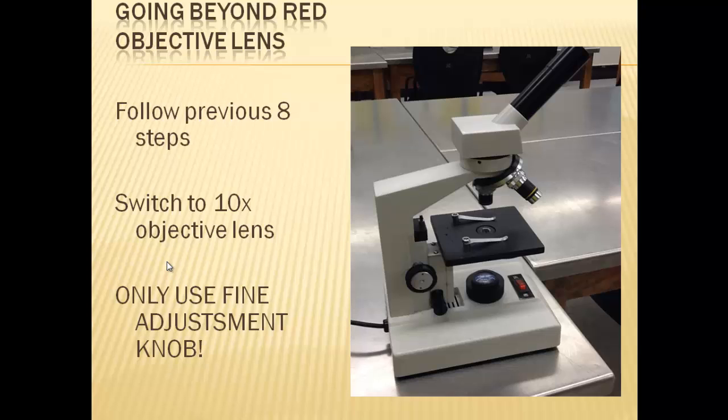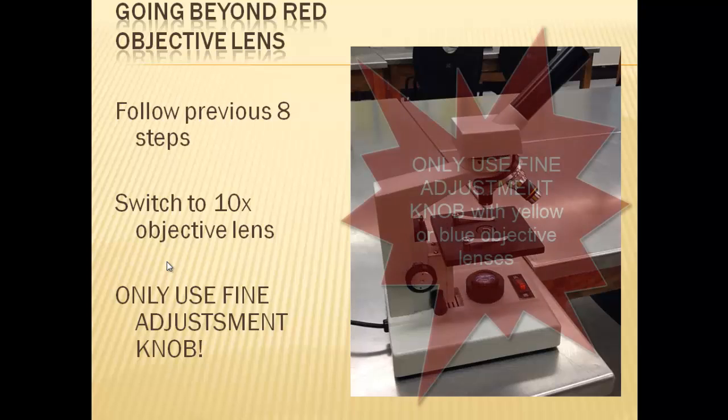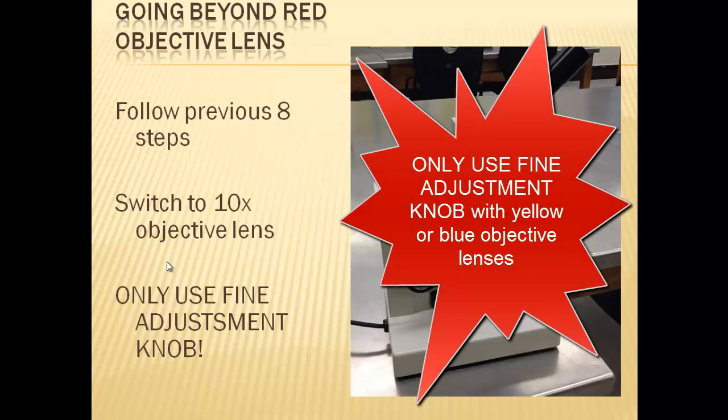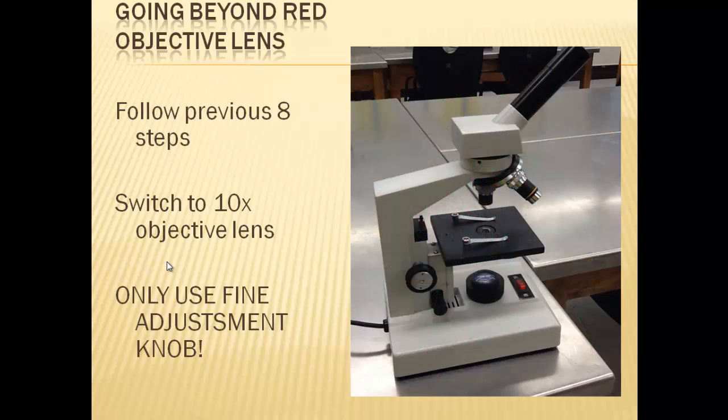Lastly, you never, ever, ever use the coarse adjustment knob when you're trying to use the yellow objective lens or the blue objective lens, the 10 power objective lens or the 40 power objective lens. You don't want to move the stage. You just want to sharpen the image. You don't actually want to move the stage at all or move the stage much.